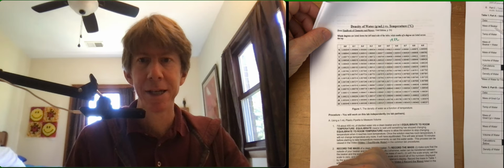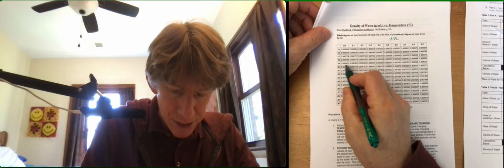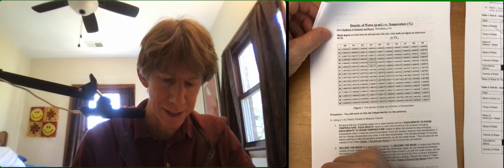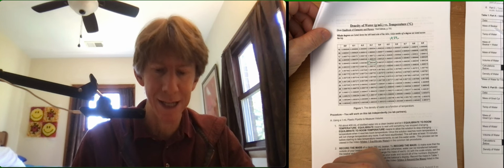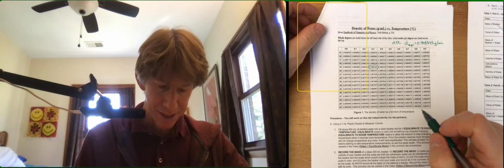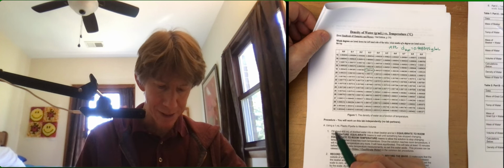We'll get to that part, but let's say your temperature was 19.3 degrees Celsius. Then you would read the 19, go over to the 0.3, and at 19.3, this would be your density of water. The density of water at that temperature is 0.998345. And we might refer to that as the density of H2O equals 0.998345 grams per milliliter. Everything has units. Good. And then right under that is the procedure.